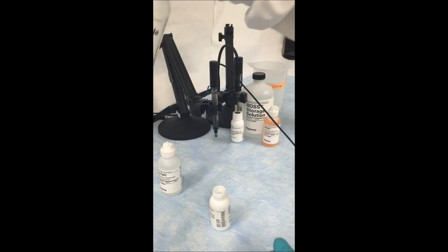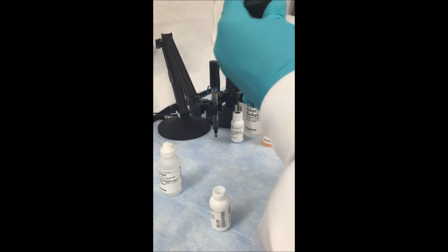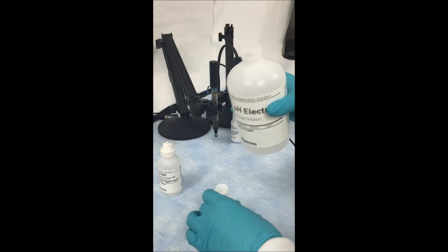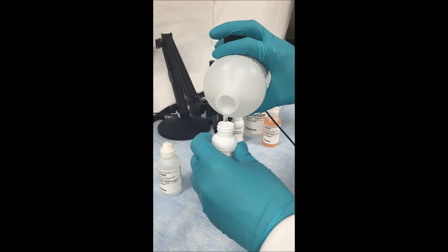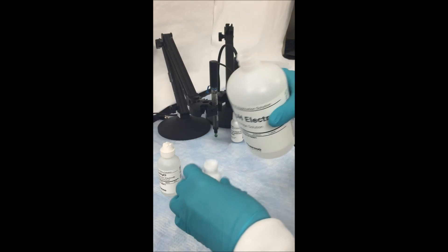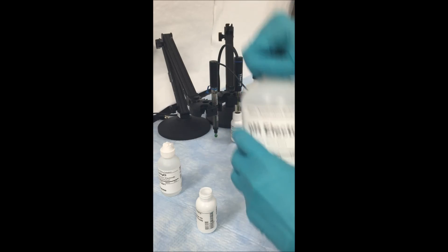Then choose the appropriate storage solution for your electrode and fill the storage bottle at least 60% of the way. You want to make sure that the entire bulb of your electrode is sitting in storage solution to keep that bulb clean and functioning properly.